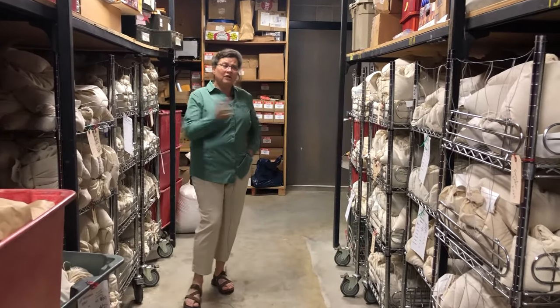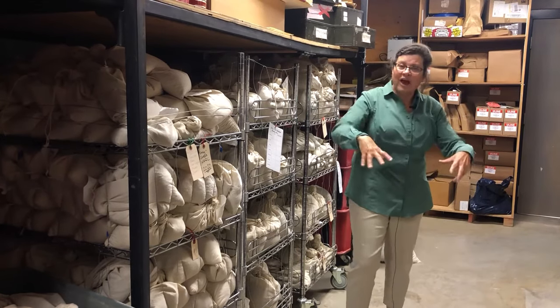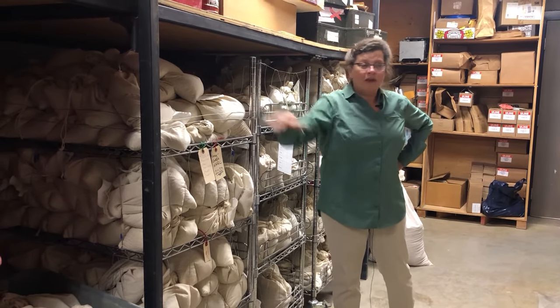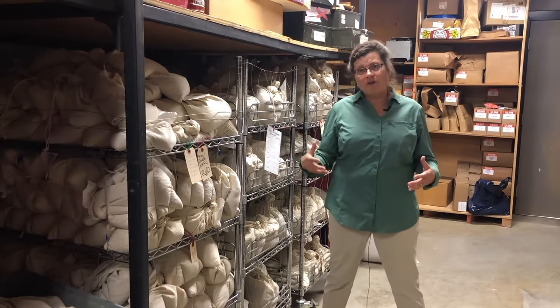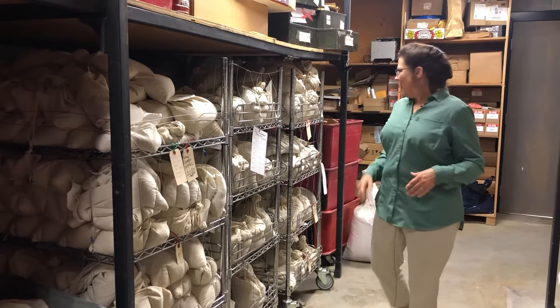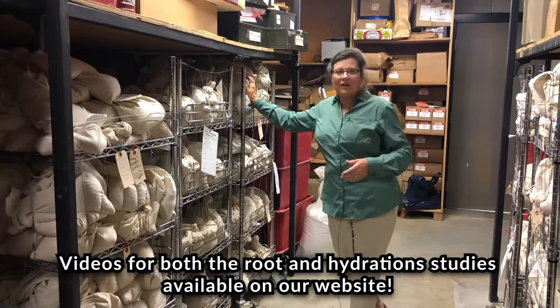Another thing I'd like to talk about is that in this room we have not just breeding program material but also experimental material. Remember those populations we created for malt quality analysis and genetic analysis? There are actually two experiments right here. This experiment looks to understand the genetic control of root length. As a maltster you might think, why would I care about that? Well, if we've got a better root system, we're going to be able to grow barley in drier environments, and the amount of water the barley gets impacts its quality. So we're hoping that bigger root systems will give us more sustainable, stable malt quality. And here's a rack of another genetic population that's actually varying for the speed of hydration and some other important quality traits. Everything that was out in the field ends up coming through this room.